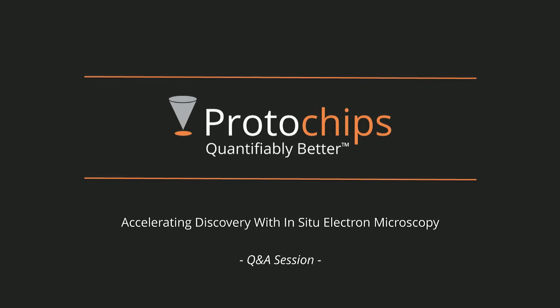That's a really good question. So we have done that. The second part of our research is we wanted to use amorphous precursors and study how these materials form layer by layer using a technique called thermolysis, or breakdown of these molecular species. We performed experiments both on the STEM at atomic resolution and near atomic resolution using HRTEM on our FEI or Thermo Fisher Titan microscope that's equipped with a OneView camera. So we've tried that to increase the temporal resolution a bit. So absolutely, we have done that.